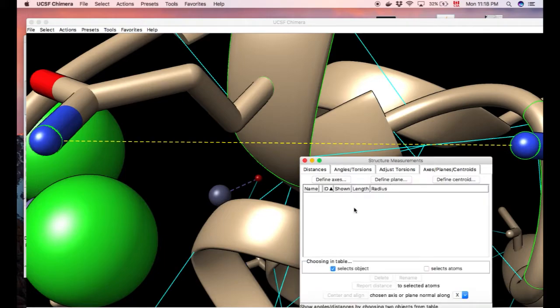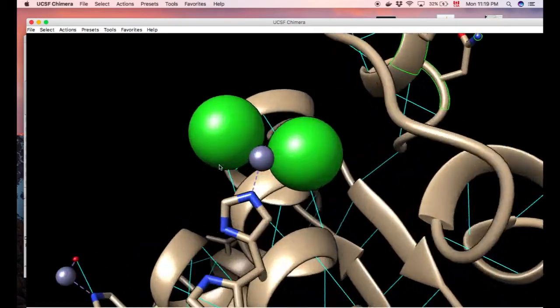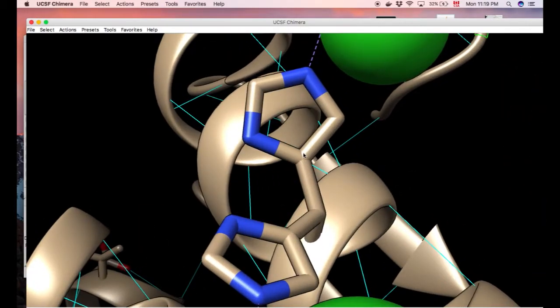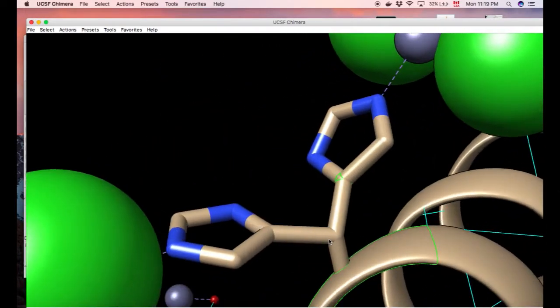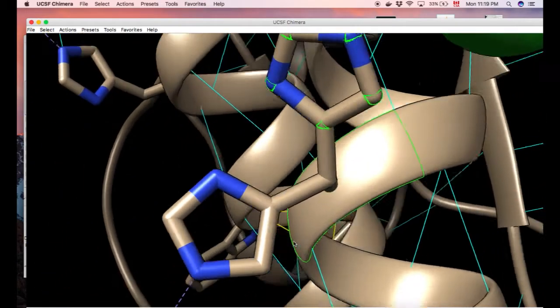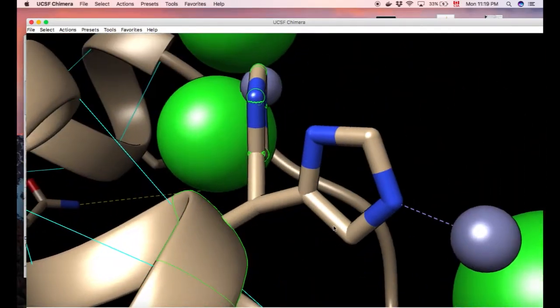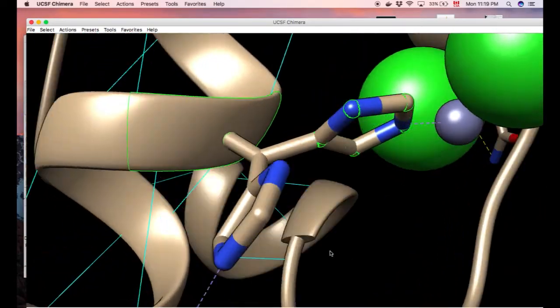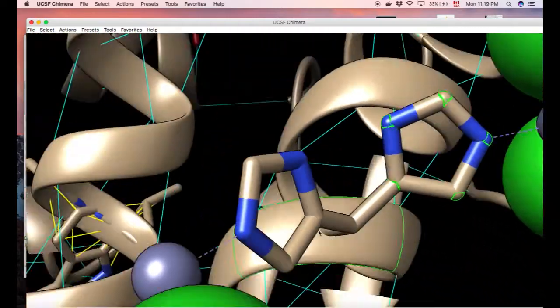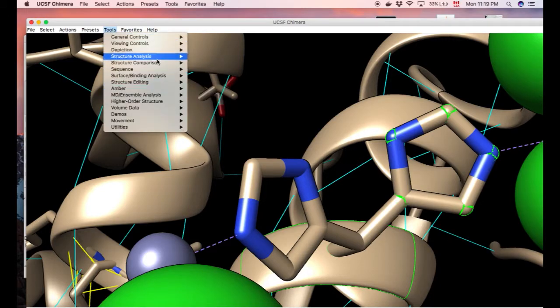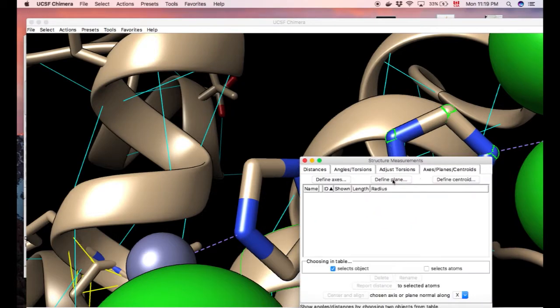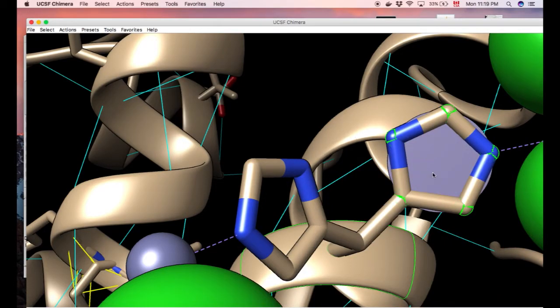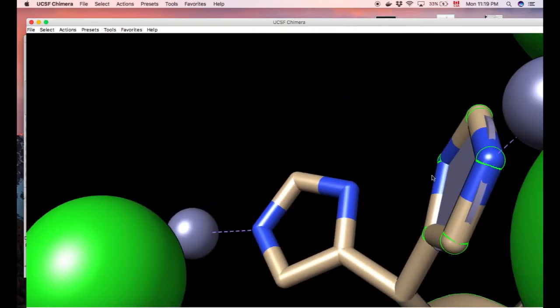At the same time, there's an interesting tool called planes, centroids, and axes. So let's find something a little bit more cyclic to analyze. So nice here. I have a very abnormal histidine. But let's go over that for now. Let's just analyze it with the centroid. I guess this PDB had multiple flaws with its PDB construction, or maybe it's just UCSF Chimera the way it reads it. I don't usually have these kind of problems, but let's bypass it for now. So just structural analysis, distances, and hop back in to axes. So define a plane, defining a plane basically creates a plane in the middle.